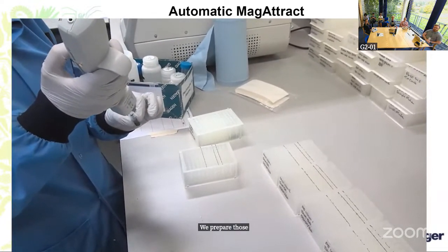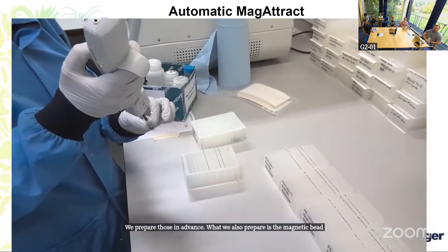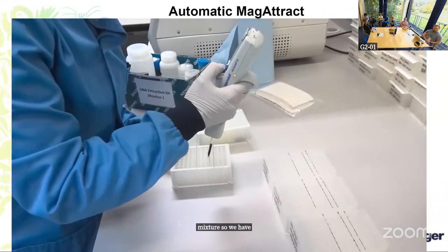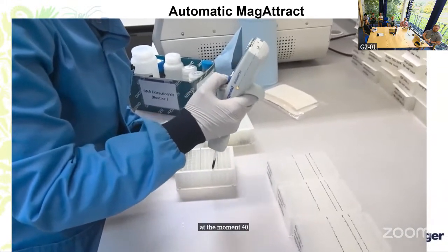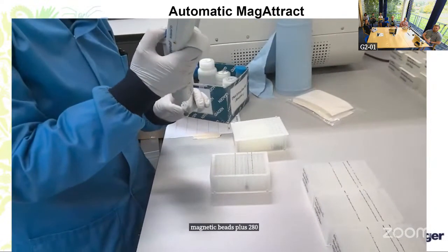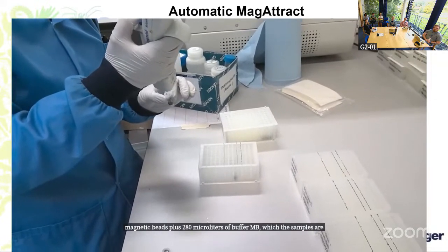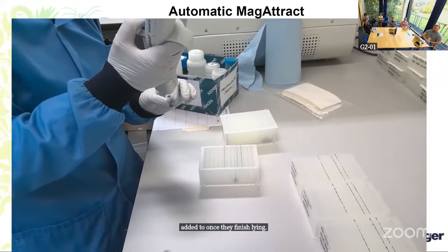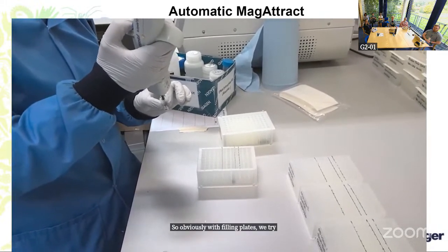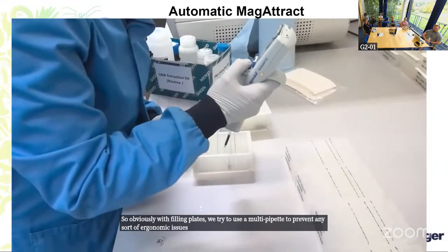What we also prepare is the magnetic bead and binding buffer mixture. At the moment we have 40 microliters of magnetic beads plus 280 microliters of buffer MB, which the samples are added to once they finish lysing. Obviously when filling plates, we try to use a multi-pipette to prevent any sort of ergonomic issues moving forward.